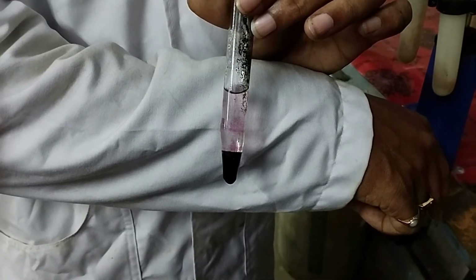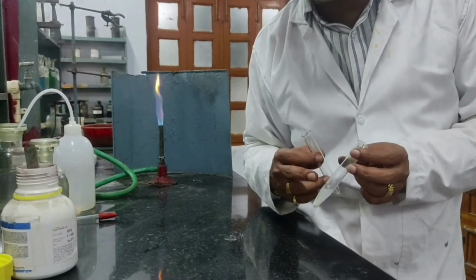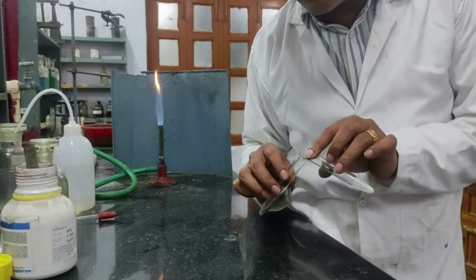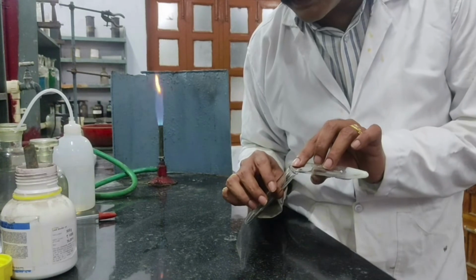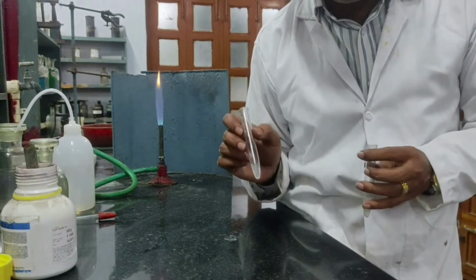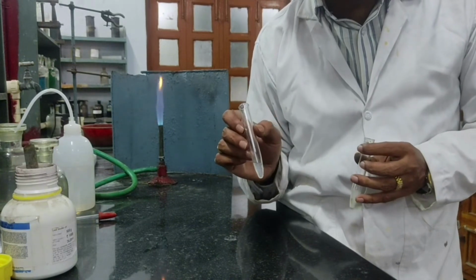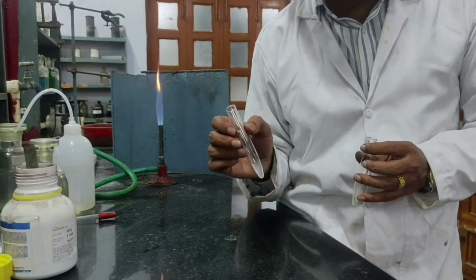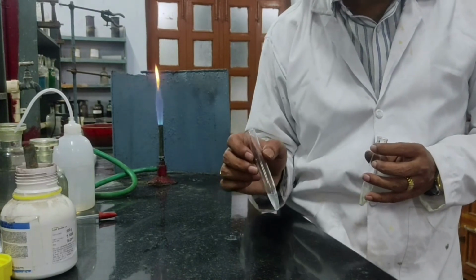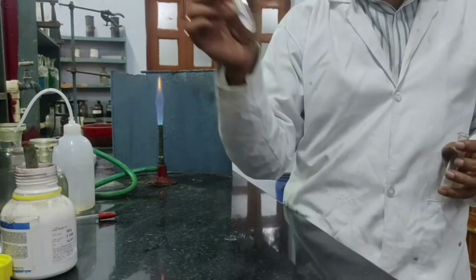Okay, right. The centrifugate must be tested for the presence of zinc. For that, I am taking this centrifugate and making it into two parts. This is the first part, that is the second part. To the first part, I have to add H2S gas. Then I must get a white precipitate. It is indicating the presence of zinc sulfide. Okay. It is confirming the presence of Zn+2.